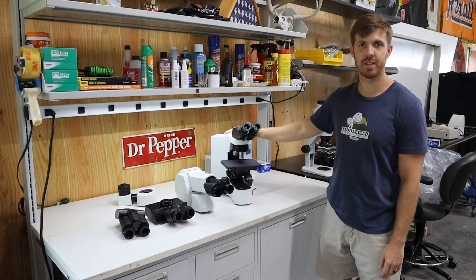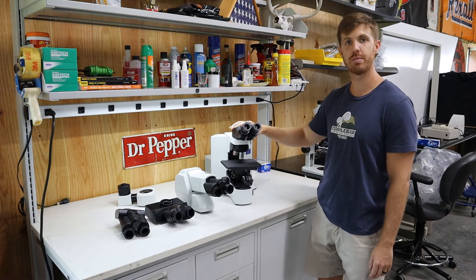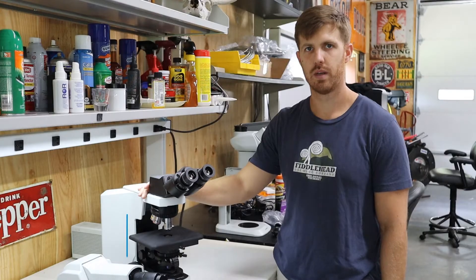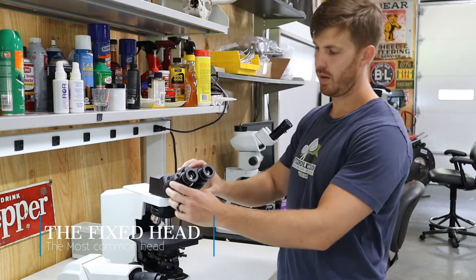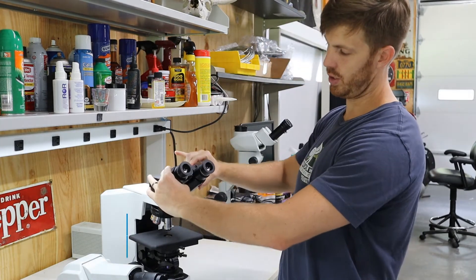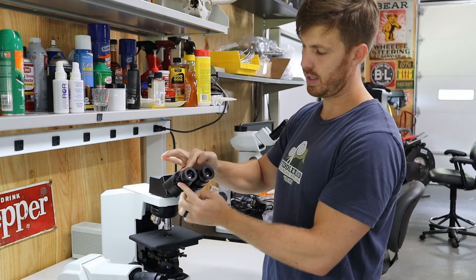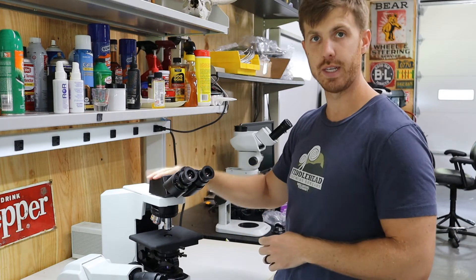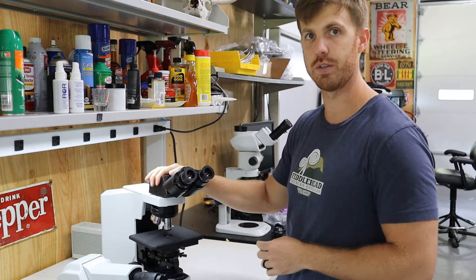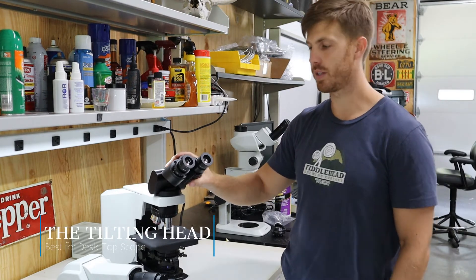This is Chad with Monday Scientific. Today we're going to show you the difference between microscope heads on an Olympus BX microscope. First, we're going to show you the Olympus standard fixed head right here. This adjusts for the distance between your eyes, and the diopter adjusts for the difference between your eyes. This is going to be the least expensive of the heads we're going to show you today.